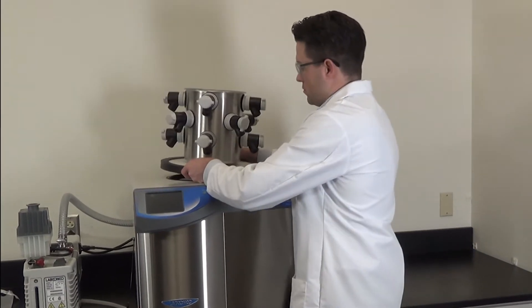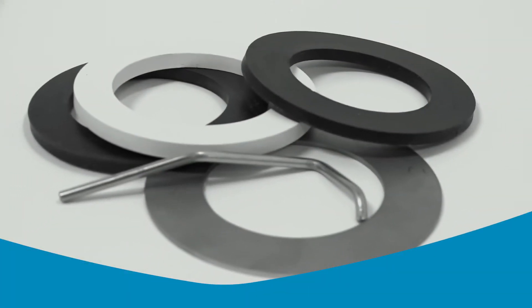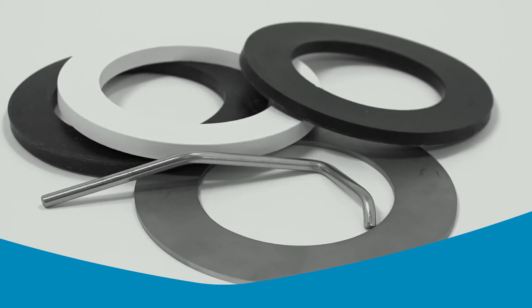When attaching drying accessories, it's important to ensure the gaskets, collars, and pins are installed as directed. This ensures low vacuum levels can be achieved during lyophilization.